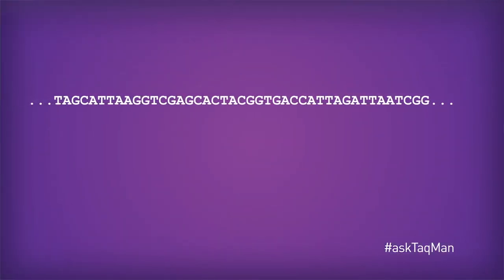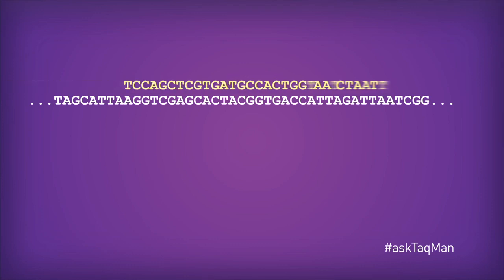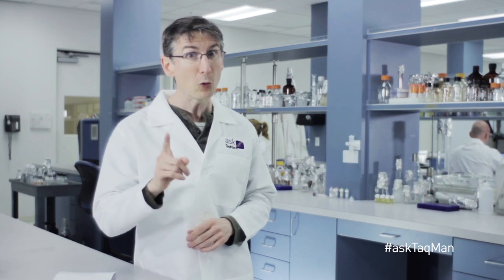Here's an example of a target sequence to which I want to design a probe. And here's the probe. Notice the FAM reporter on the 5' end, and of course TAMRA dye doing the quenching on the 3' end. Now, this probe will work, but just note there are a couple of potential drawbacks to using TAMRA dye as the quencher.